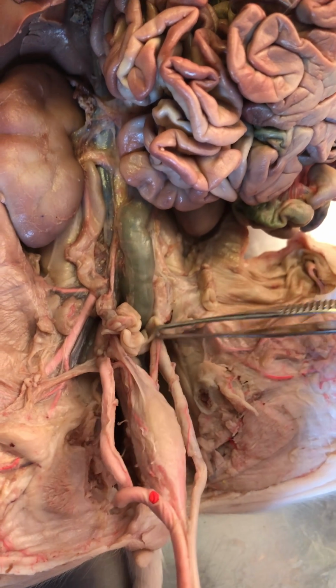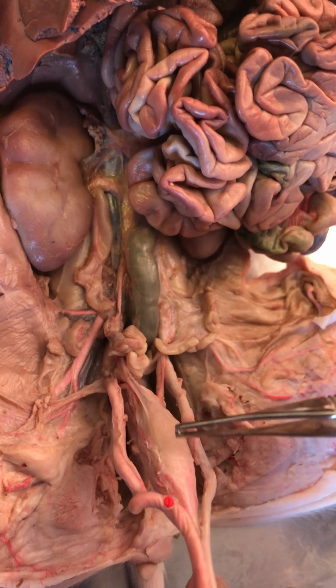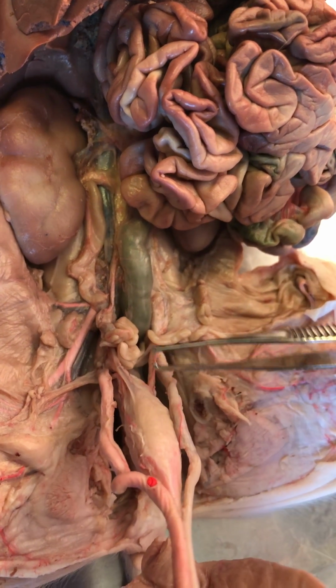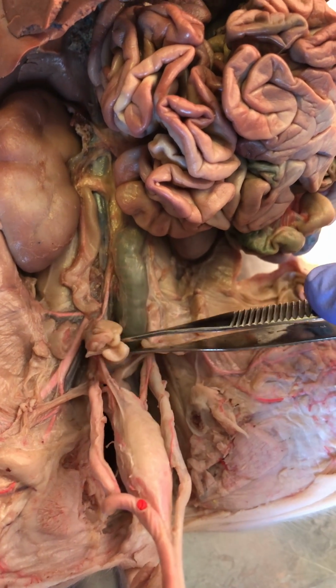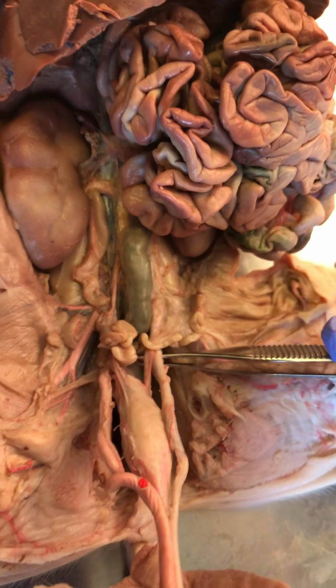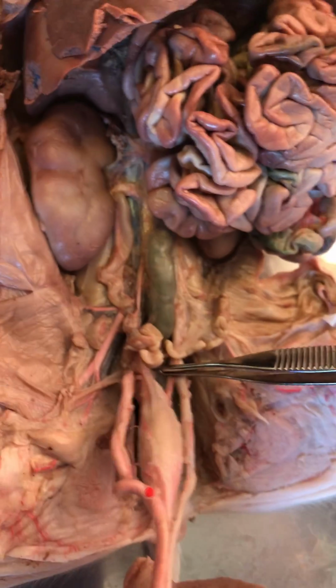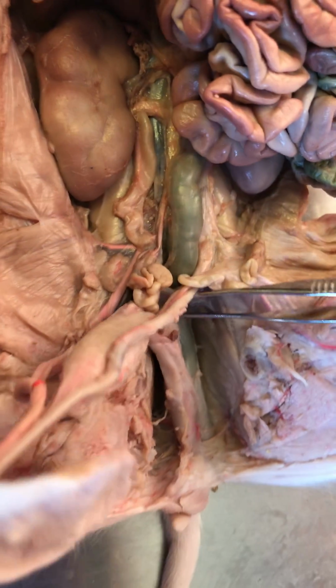So those two horns of the uteri are going to meet. Let's remember, I'm picking this up here. This is the urinary bladder. So we're going to be dorsal to the urinary bladder. And you can see those two uterine horns are going to meet. I'm going to come under there, see where I'm poking. That's going to be the body of the uterus. There it is right there. The body of the uterus.